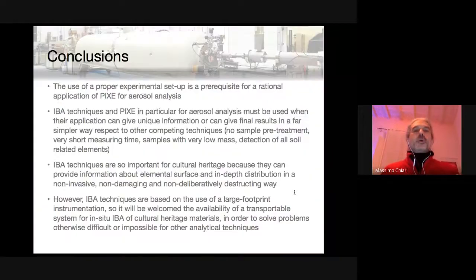Okay, so that's my conclusion. My conclusion is that you can still use ion beam techniques in the field of cultural heritage and environmental application. It is not fading. It is indeed vamping or revamping, obviously using the proper equipment.